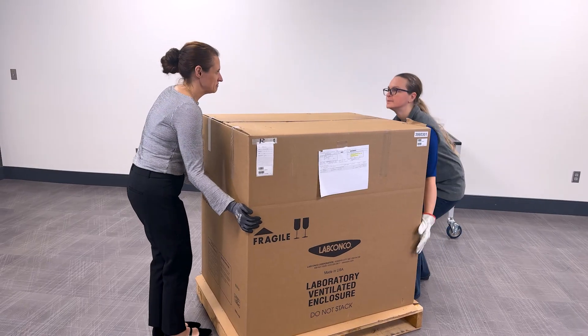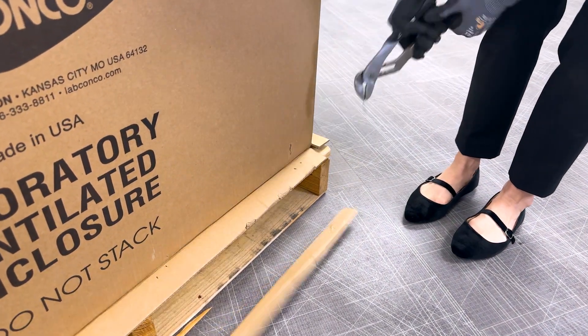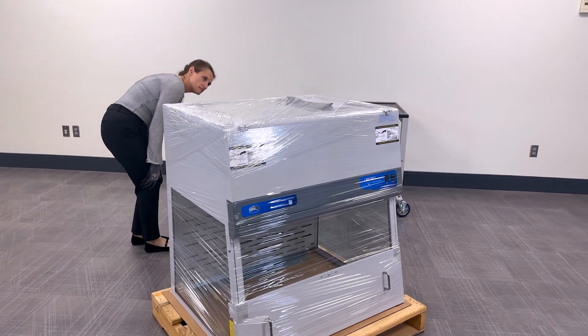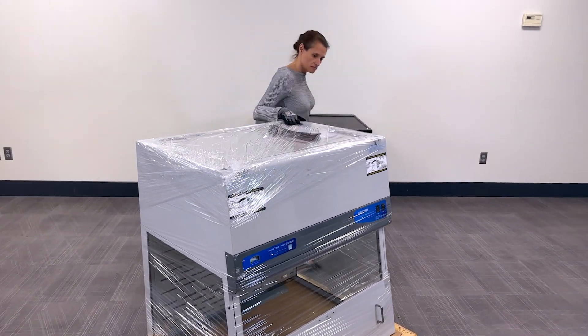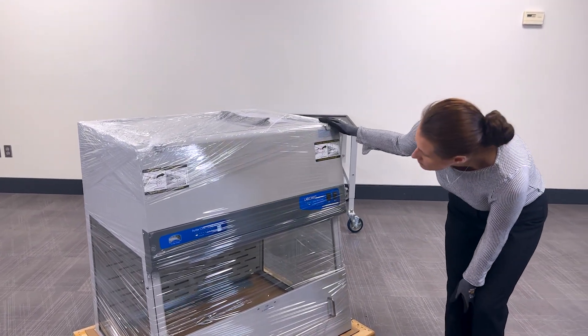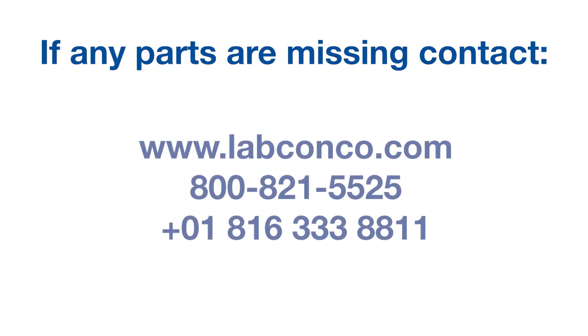Now, remove the cardboard box by detaching the staple securing the carton to the pallet. Once the small enclosure is unboxed, inspect again for any shipping damage. If damage has occurred, contact the freight carrier that delivered the small enclosure to file a claim — be sure to photograph any damage you notice. If any parts are missing, contact a LabConco associate for assistance.